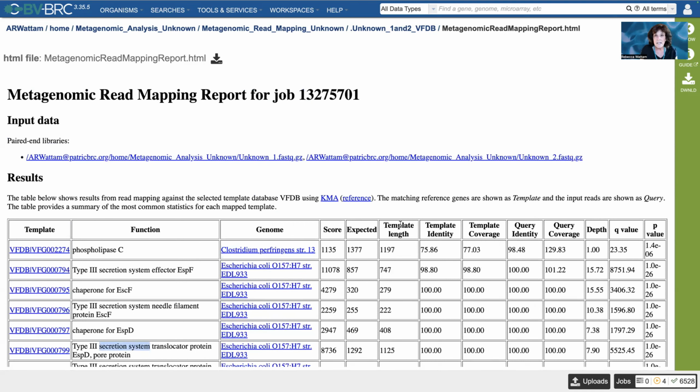I would never say, oh, my genome's resistant to tetracycline, or oh, it's got this particular pore protein. I want to compare that to published data to see if it really is the thing I need to be concerned about. So it's pretty short, it's pretty sweet. You should be able to run it easily, and I hope that you do.